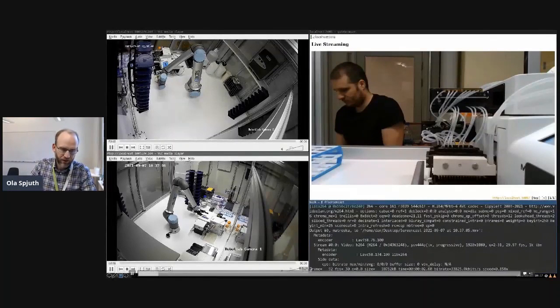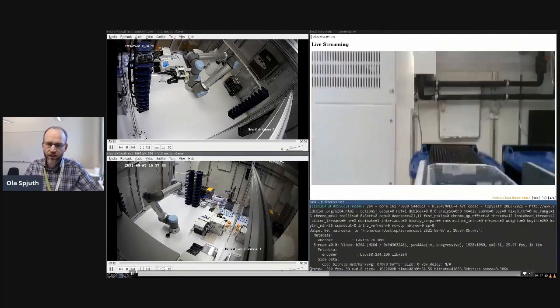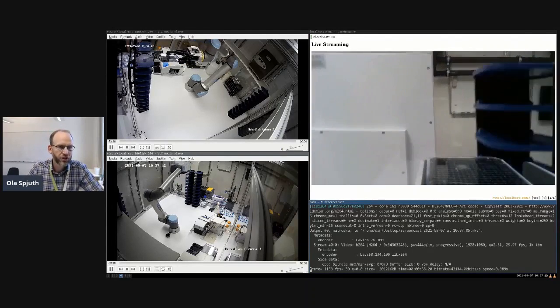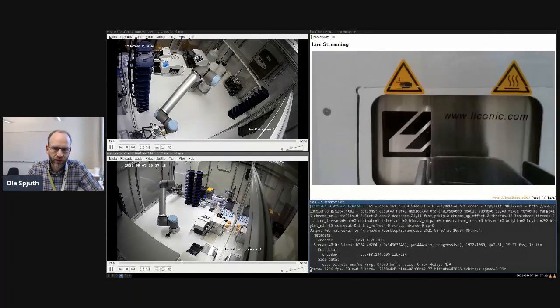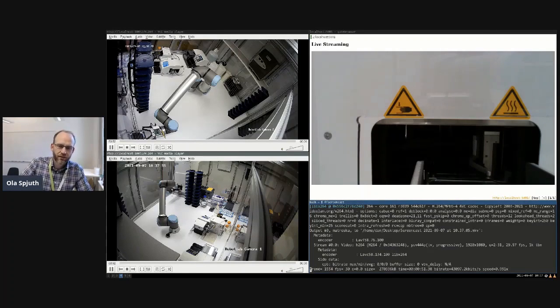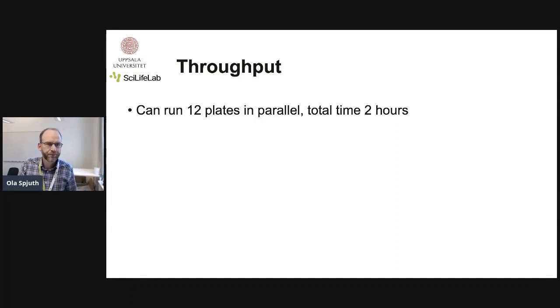You can see Dawn here. I'm going to fast forward a little bit onto this. Dawn has been working with the robot. Here you see a lidding and delidding. So you have 3 cameras. They're all relatively in sync. They're just in 3 different positions, and we see the robot arm moving it now into the incubator, and now issuing a REST call to the incubator, pick up the plate and incubate it for some time. And the system then comes out and takes over and continues with it. Well, it's just a taste of the system here.